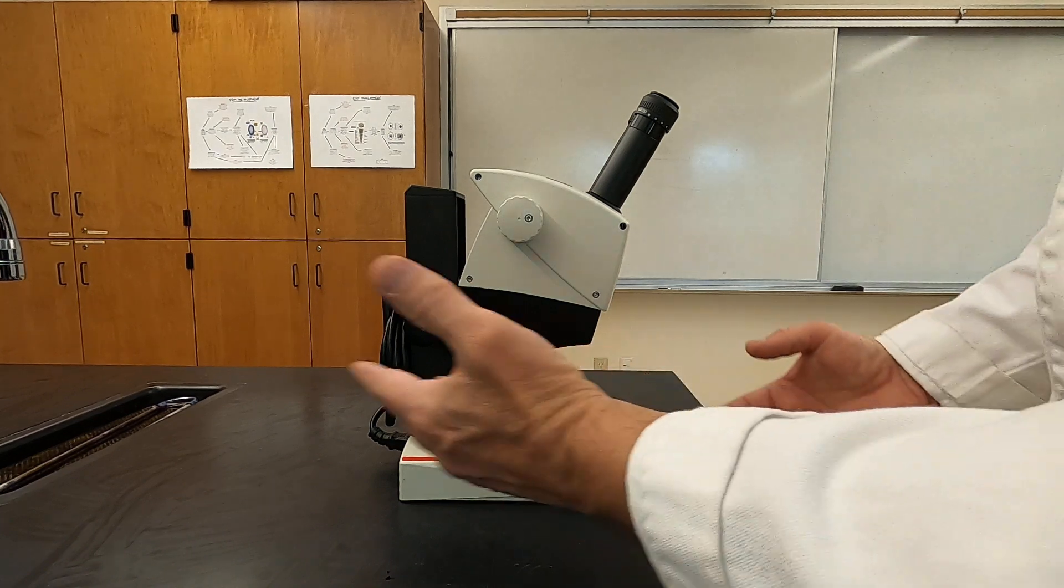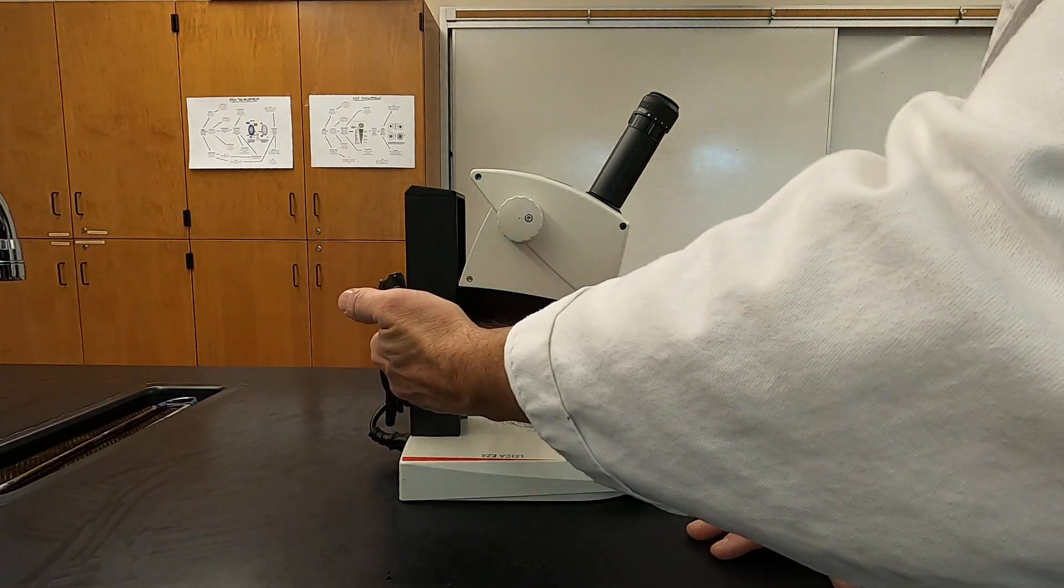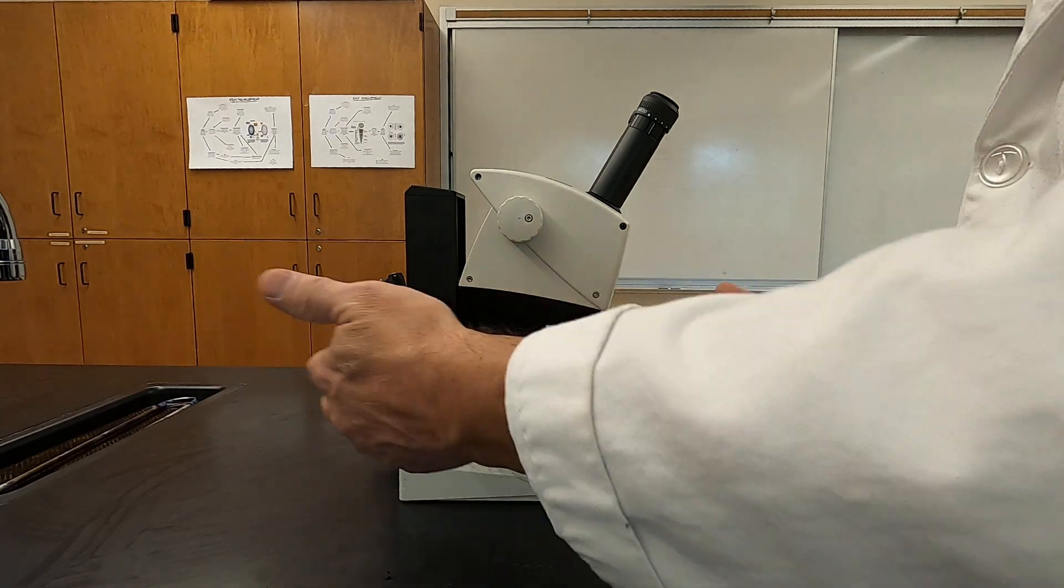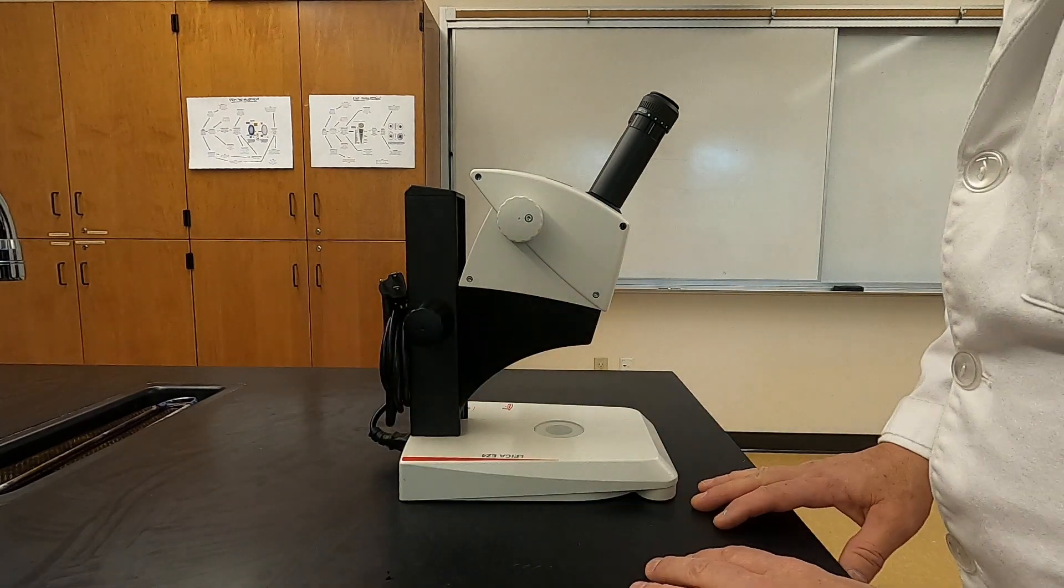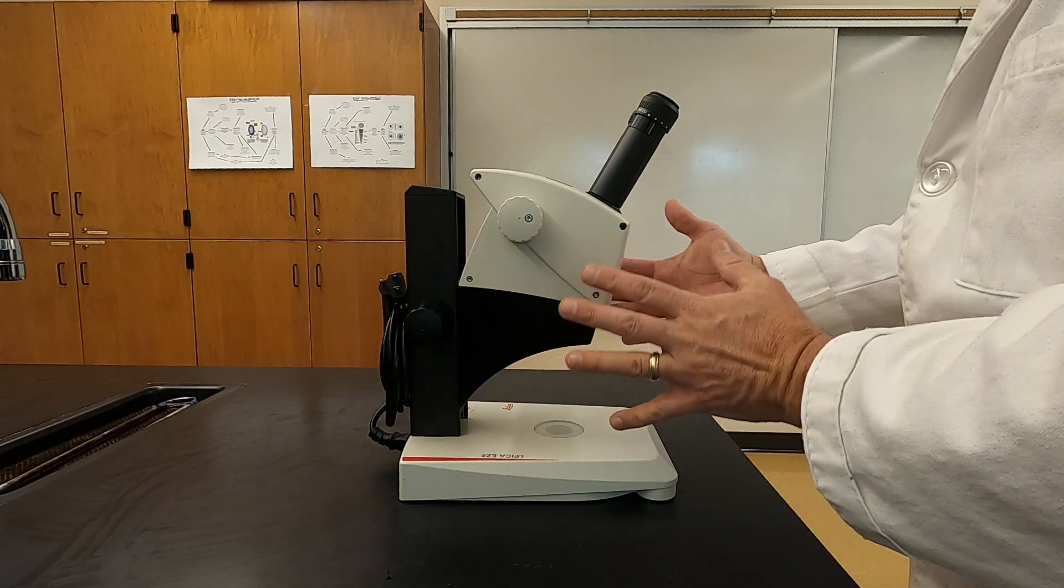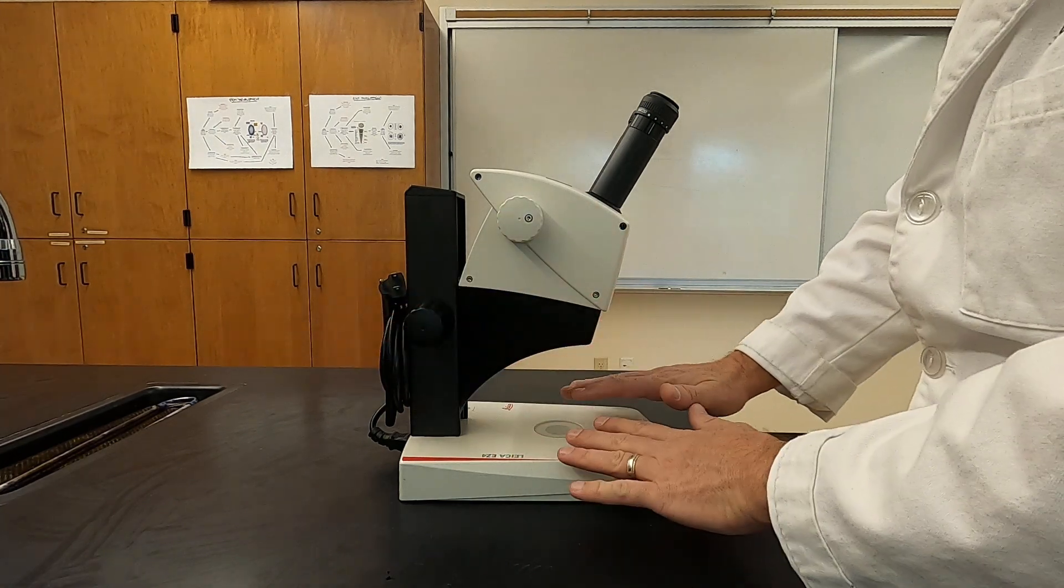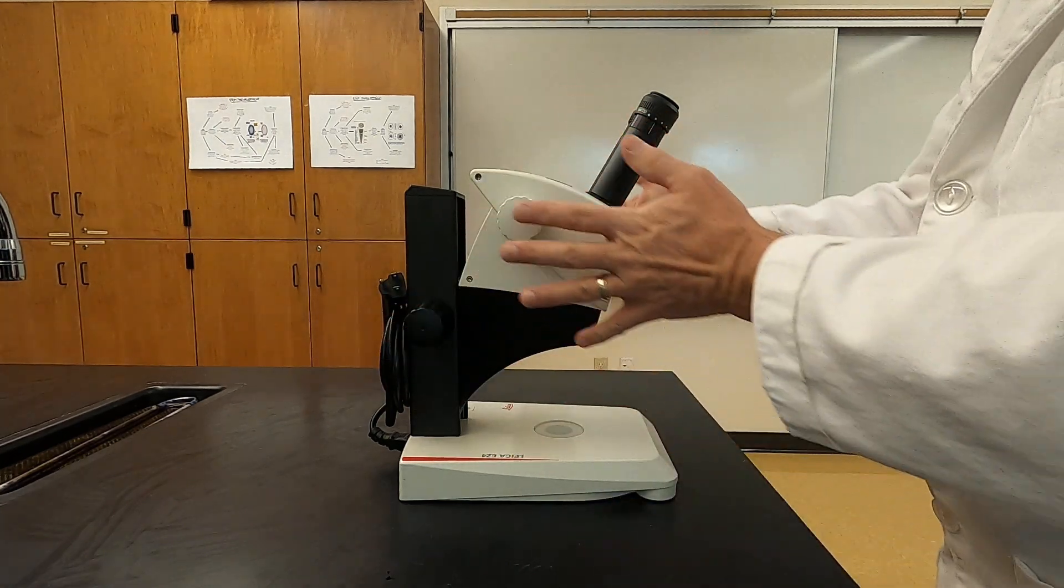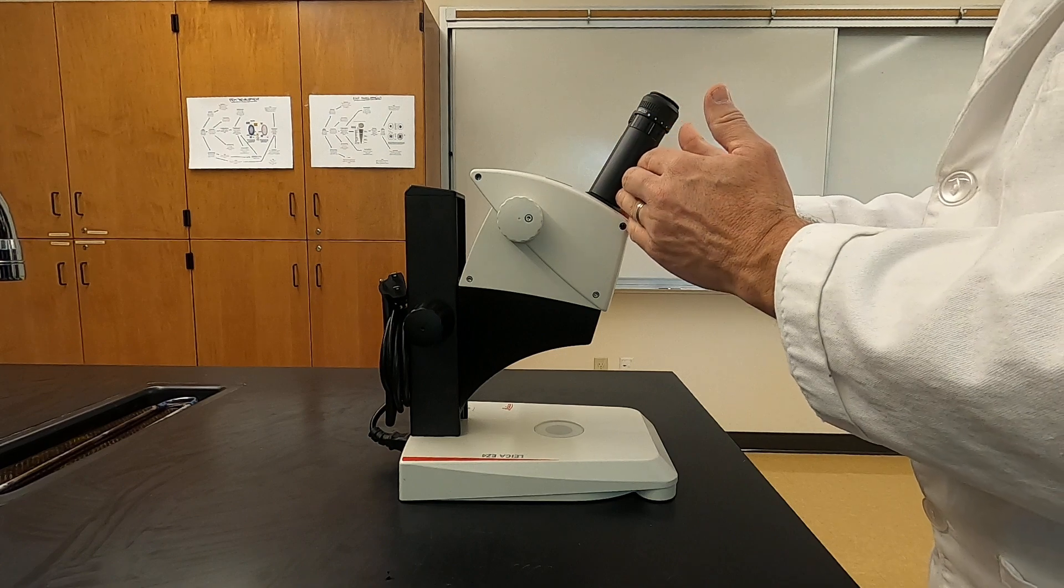So this is what it would look like as you were taking it out. The cord would be neatly wrapped. You'll notice the orientation is the opposite of what we saw before, with a cord in the back and then the open stage in the front and more of the controls in this area with the ocular lenses.